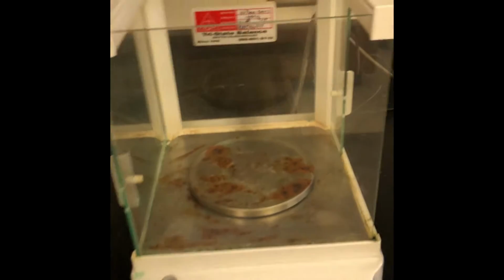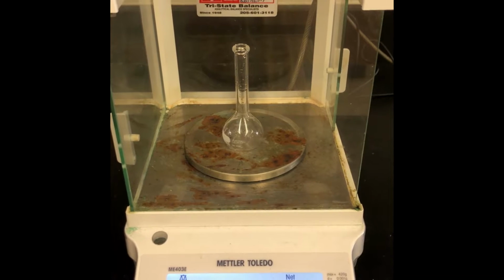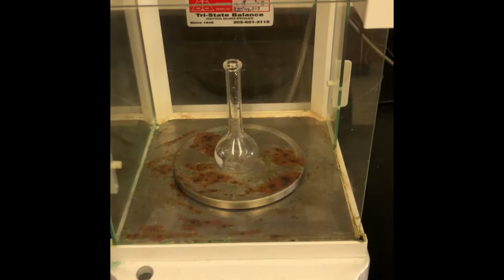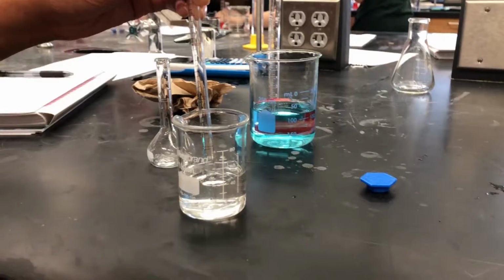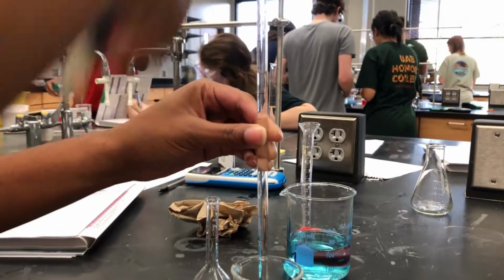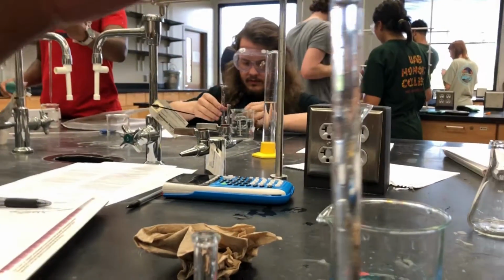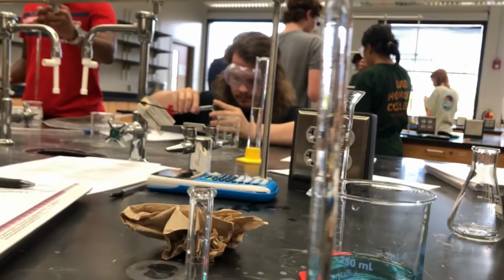For challenge 2, the 25 milliliter volumetric flask is used to hold and dilute the 20% sugar stock solution, so the mass is found for later use, which is 19.488 grams. We then measured 3 different volumes of the 20% sugar stock solution and transferred it to the 25 milliliter volumetric flask. This volume of stock solution was 3.71 milliliters.